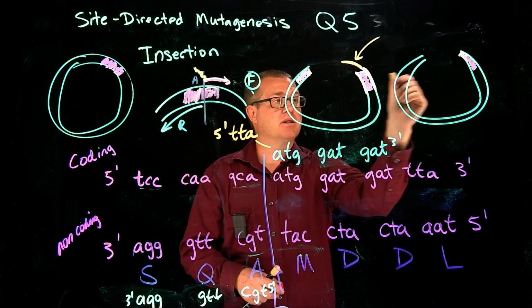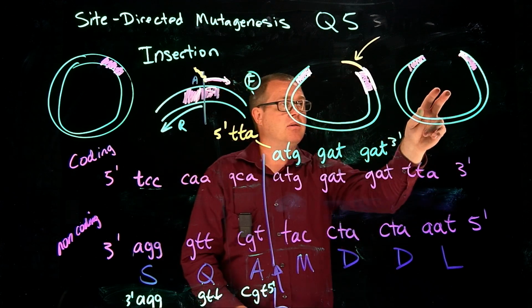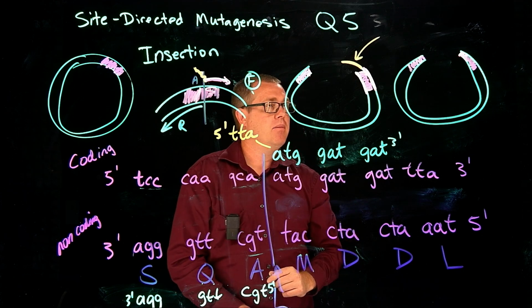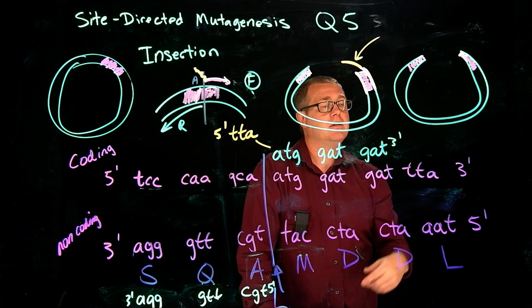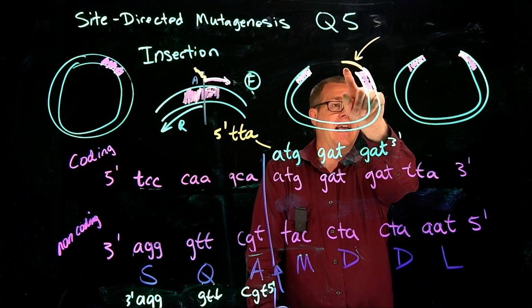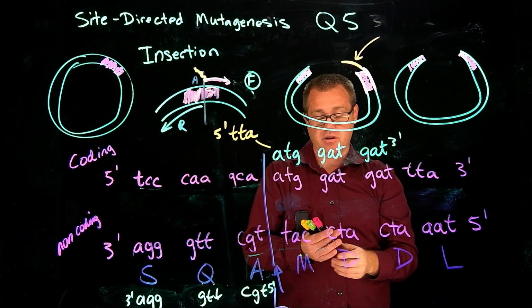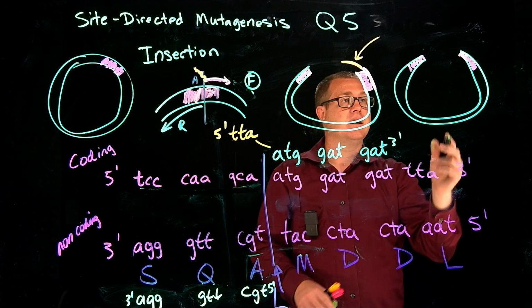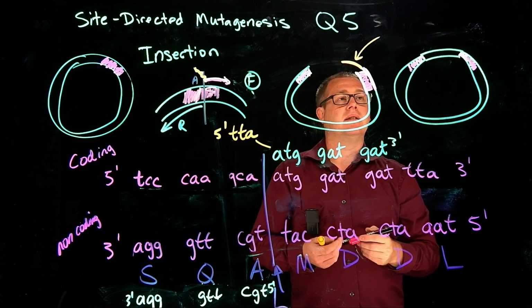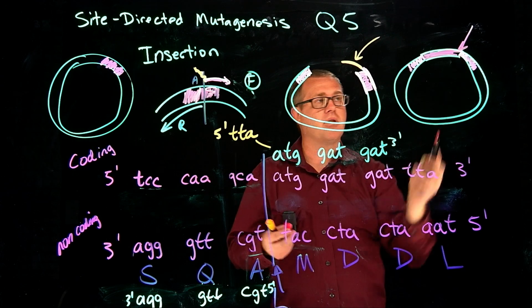And then this piece just stays the same, like there. So after the second round, you're going to start getting your plasmid there with the insertion included, not just fluffing and hanging off. It's going to be incorporated. And then you would take this version after doing 25 to 30 cycles and do the DNA ligase and seal that up. And you would have your complete gene right there with the insertion included, which was approximately right there.